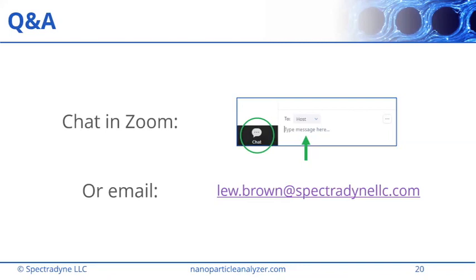And so it's important to know what your background concentration of particles is, but there's no blank normalization required nominally for any measurement. So you just put your sample in, and it counts the concentration of particles in that sample, and then you grab another sample. So you don't have to calibrate to a blank every time if that's what you're after.